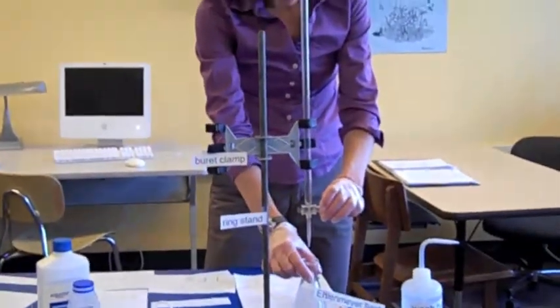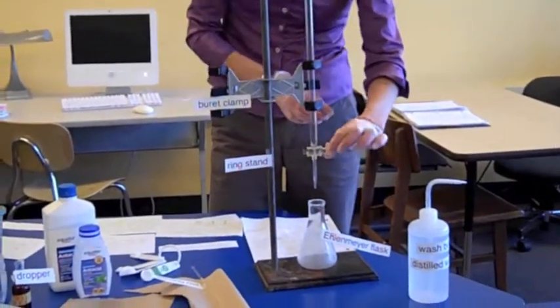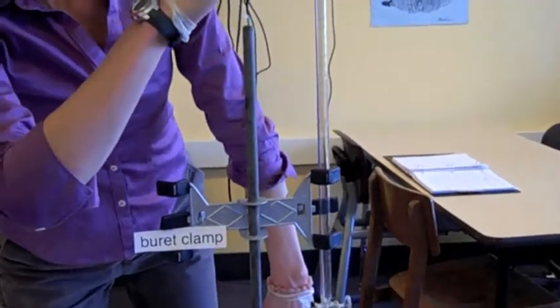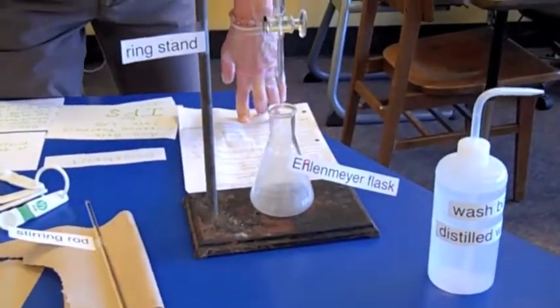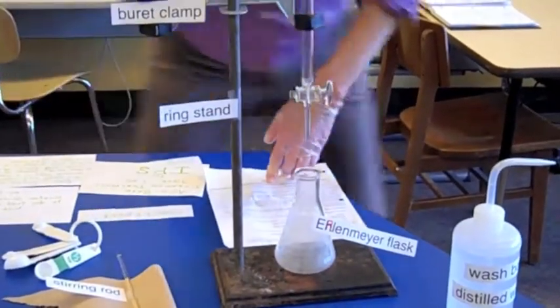You swirl it. You see you've got at least 30 seconds of pink, and you turn this so you don't get any more hydrochloric acid. That's when you write down volume of acid when color lasts. This volume can be figured by looking at this burette clamp again. It's going to be something below where you started because you've used some of this acid to neutralize this base. Maybe it's 45, maybe it's 42, somewhere in here. Just find the number.